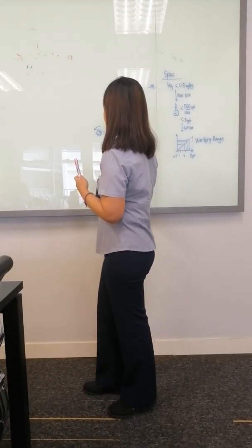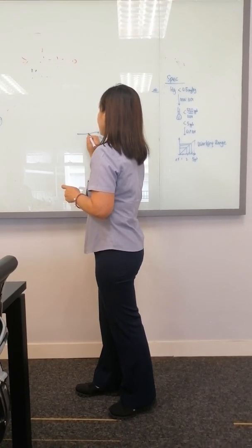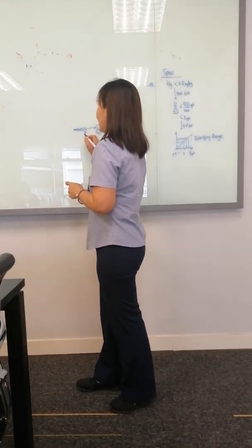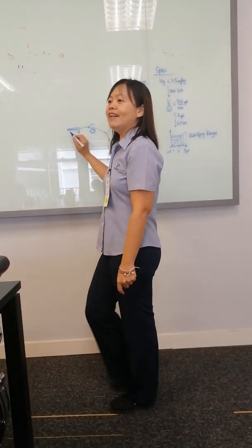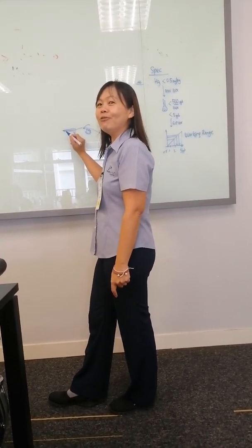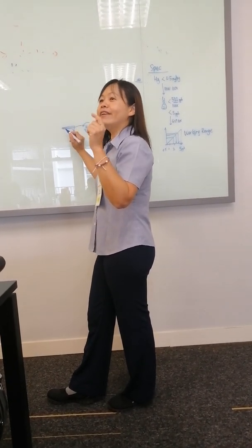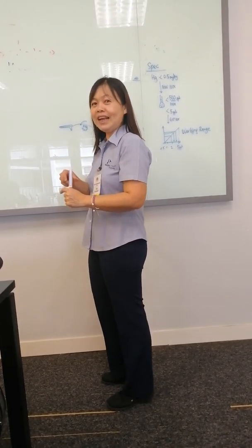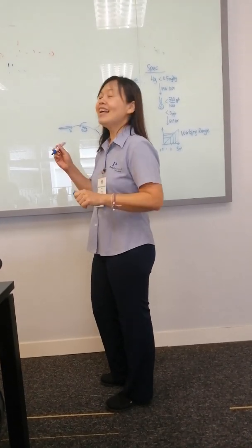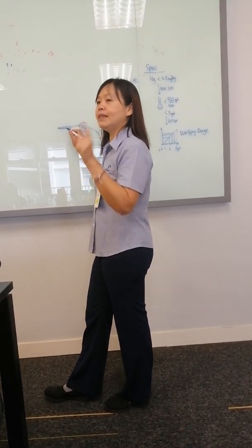Okay? So the peristaltic pump will be taking the sample in. Then after your peristaltic pump, the first thing your sample contacts is your nebulizer. So this nebulizer is the one that is going to clog if your urine has a lot of particles. I think the other day, when the urine project ran about 2,000 samples, they clogged. So our engineer brought tools to clean it, and after that they bought one. Today I also brought one, because I'm afraid you will clog. Sometimes for food samples, after microwave you filter your sample, then it's better.